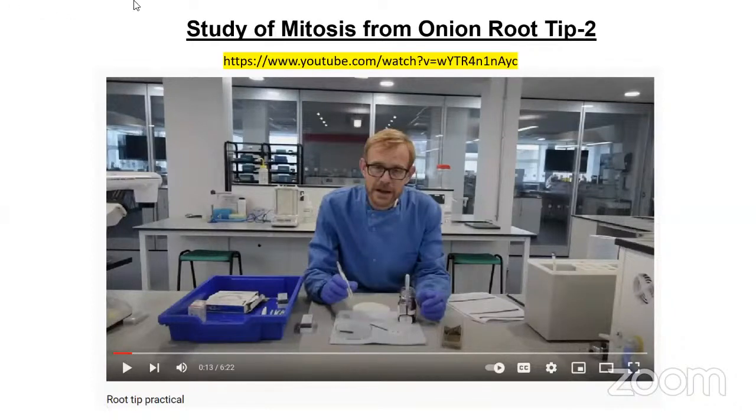So we saw how we can observe mitosis using a root tip under the microscope. By now, everyone should be clear. What are the different stages of mitosis? Prophase, metaphase, anaphase, and telophase. In prophase, chromosome condensation begins, so you can visualize chromosomes more easily.